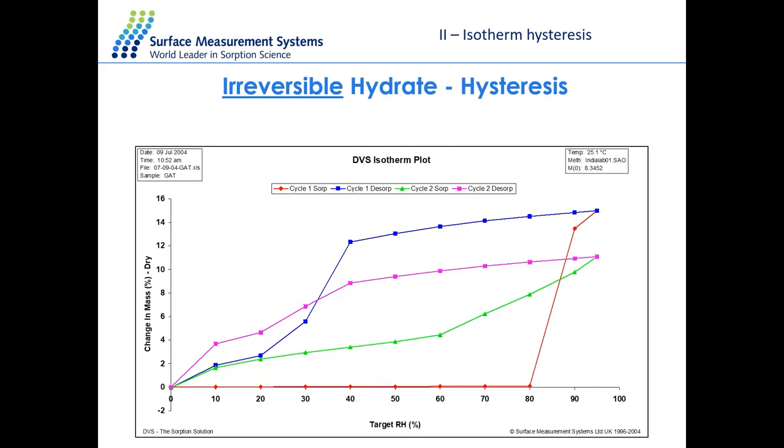Here is something slightly different. Here is a stoichiometric hydrate, but in this case it is irreversible. So let's have a look through this data. This is a 2-cycle experiment. I'm doing an absorption and desorption, absorption and desorption.